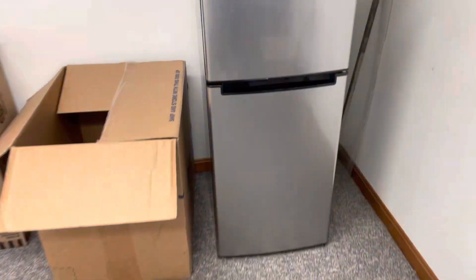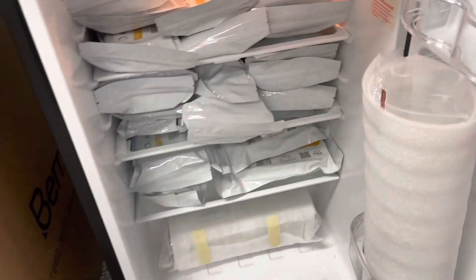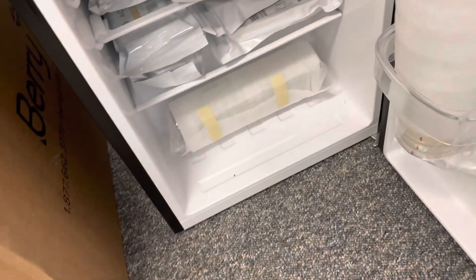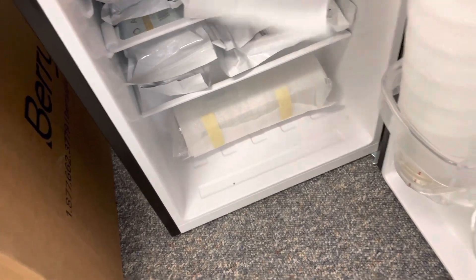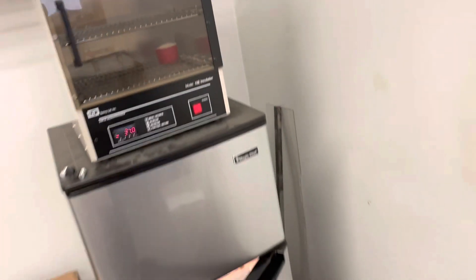I'm going to go to my mini fridge and pick out the plates. These are what we are going to grow the mastitis bacteria on, and based on what shows up on these plates after they're in the incubator for 24 hours, we can determine what type of mastitis they have.